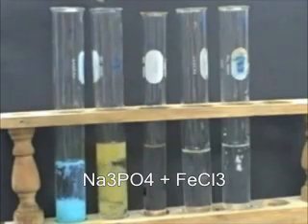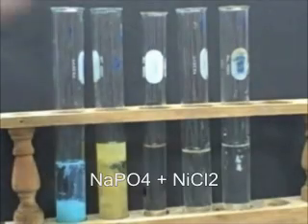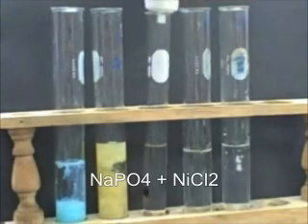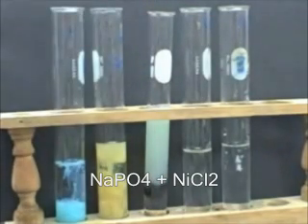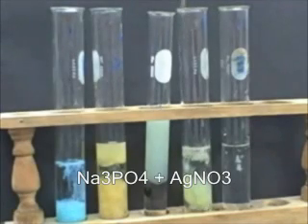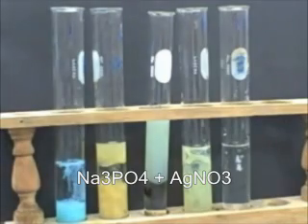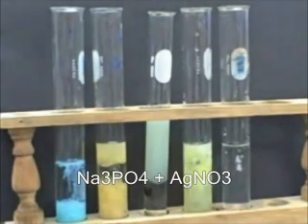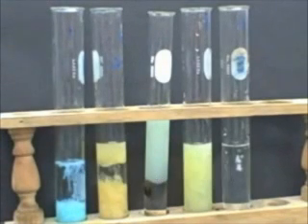Again, iron phosphate. You can look in your solubility rules, which indicate that phosphates are insoluble except with group 1As and ammonium. The third one is our nickel, and we see that the nickel chloride with the sodium phosphate forms nickel phosphate. The fourth one here is silver nitrate. Silver nitrate is soluble because nitrates are soluble, but when the silver mixes with the phosphate in the sodium phosphate, silver phosphate precipitates out.